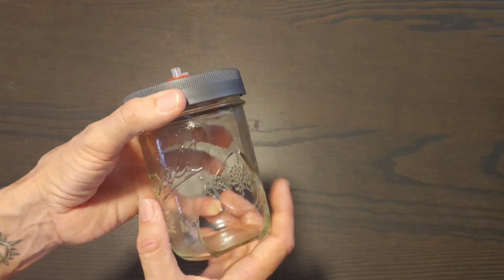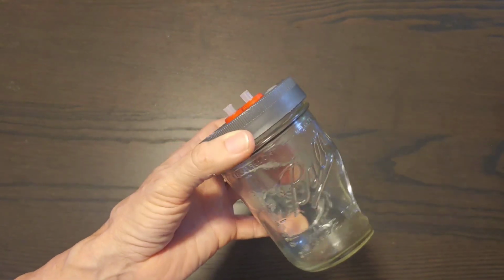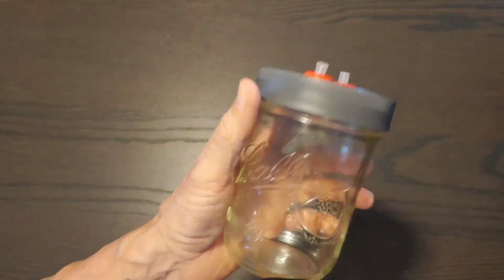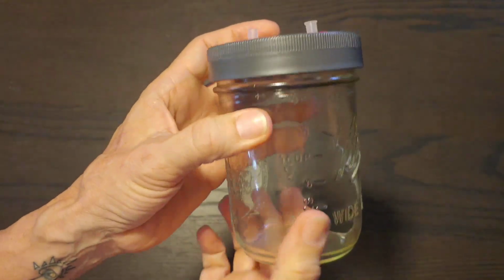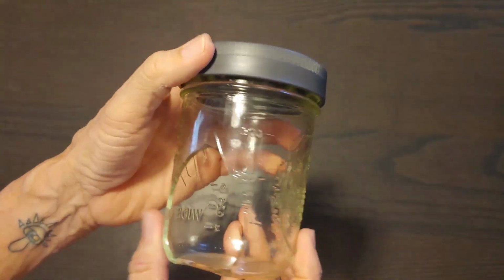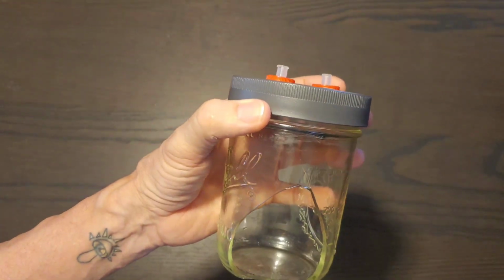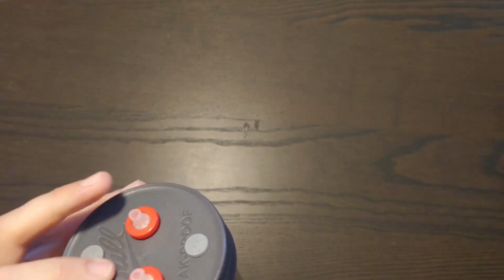Now, the weird thing is, 3 of them have cracked on me recently, and I was wondering what was going on. I haven't changed anything, they've just cracked. So I believe they're just old. I've been using them for a long time. They look perfect. I didn't see any cracks before, nothing. I think the glass from heating and cooling several times just gets old and eventually will crack.